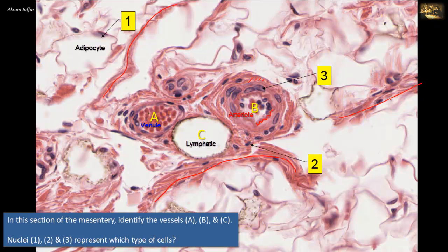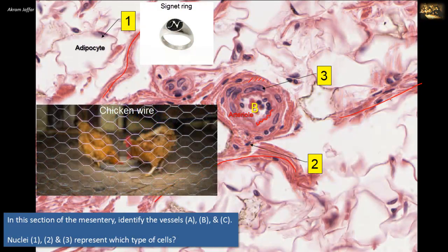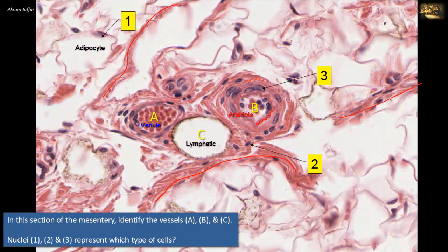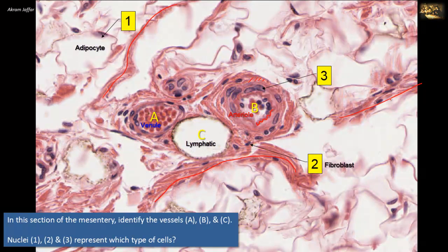During preparation of the H&E slides, the fat is dissolved and the cell appears empty with a very thin rim of cytoplasm and the nucleus is along the edge. This appearance is described as a signet ring appearance of the adipocyte or a chicken wire appearance of the adipose tissue in general.